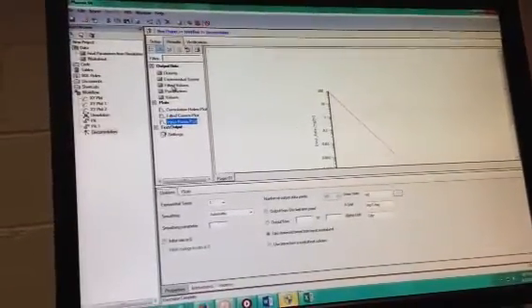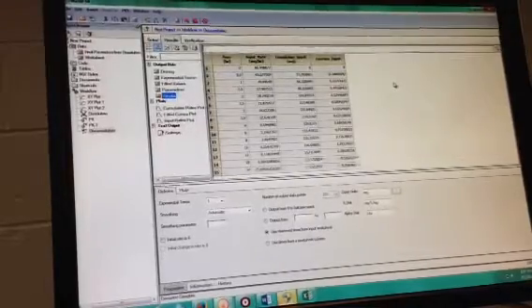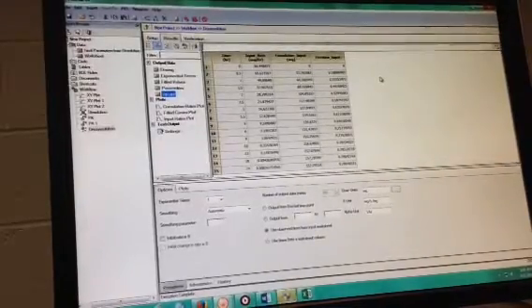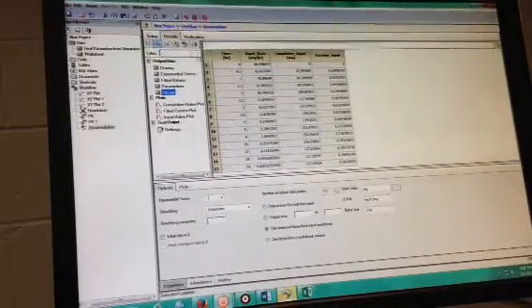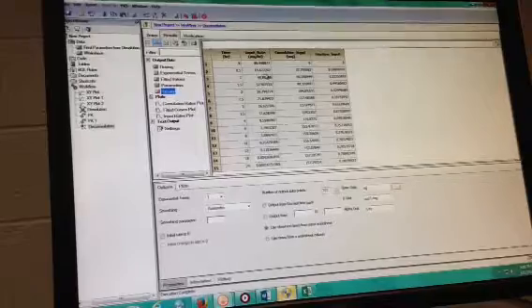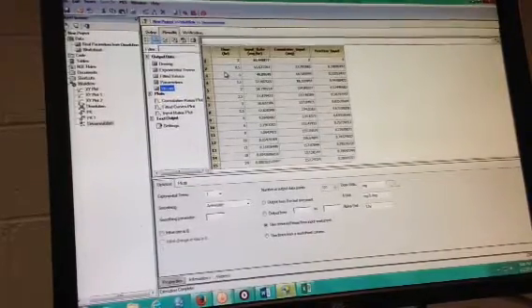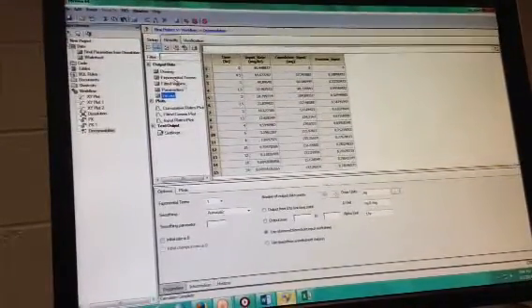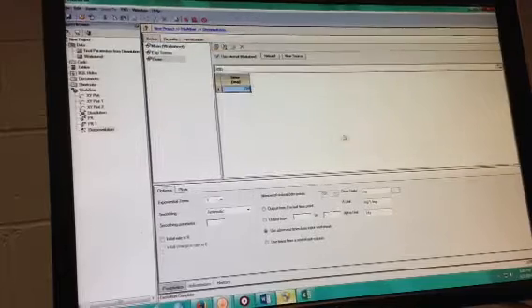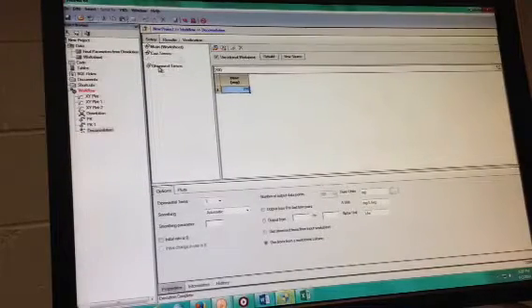I'm going to fit the values. Okay, so let me go back. Because theoretically now we want to plot this one versus the dissolution. So let me go back in the setup and see. This is use times from a worksheet column, but then it observes the time.